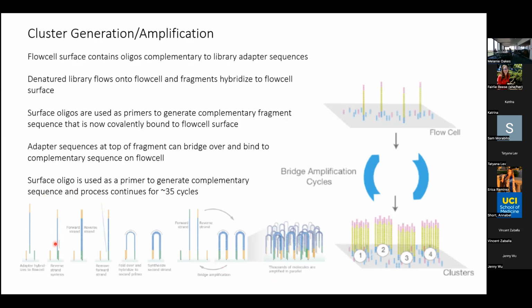The other thing that happens is that you can imagine, because we're doing this bridging all the time, the final step is that there's a cleavage step so that all of these templates are in the same orientation, because you would have had complement, reverse complement, complement, reverse complement.